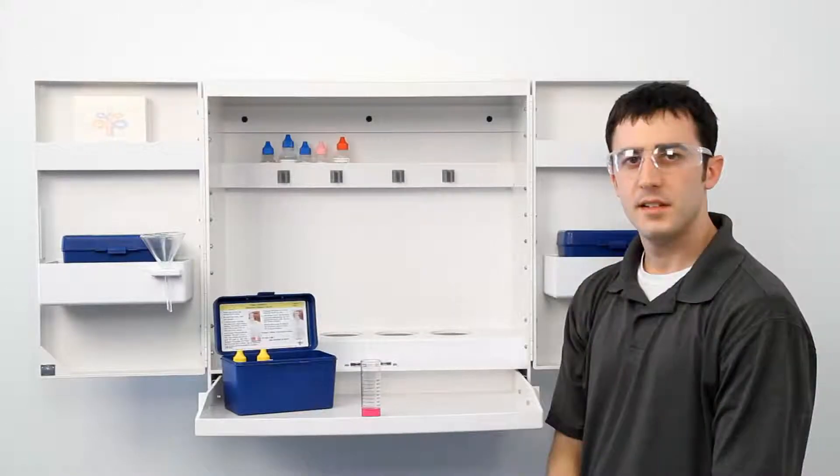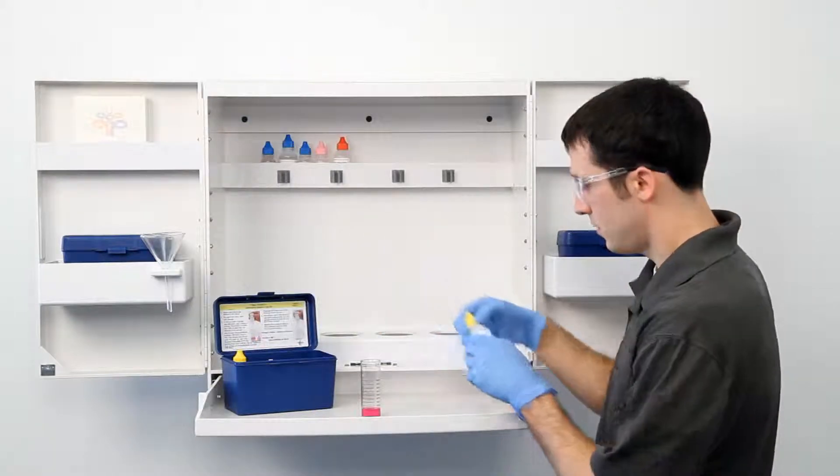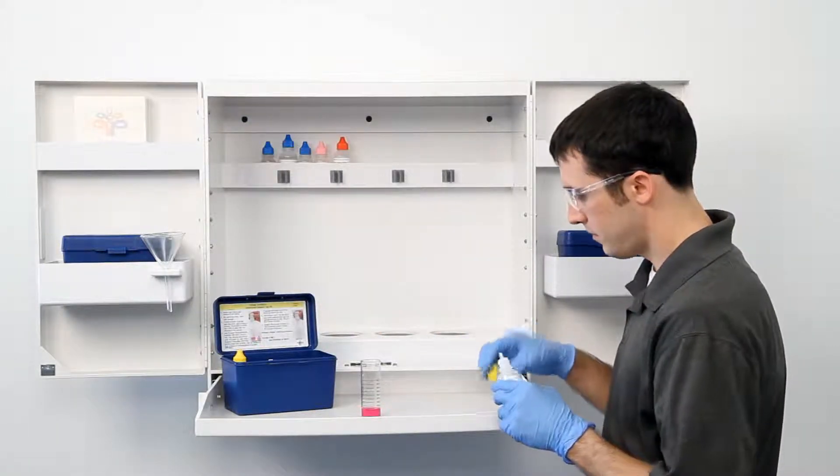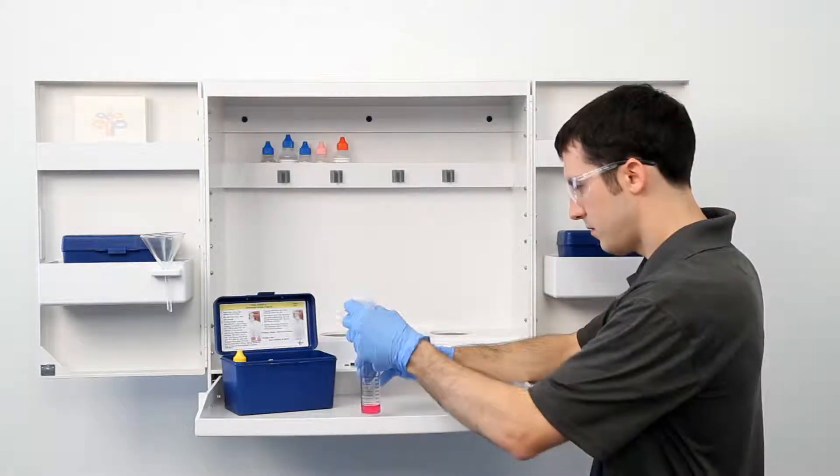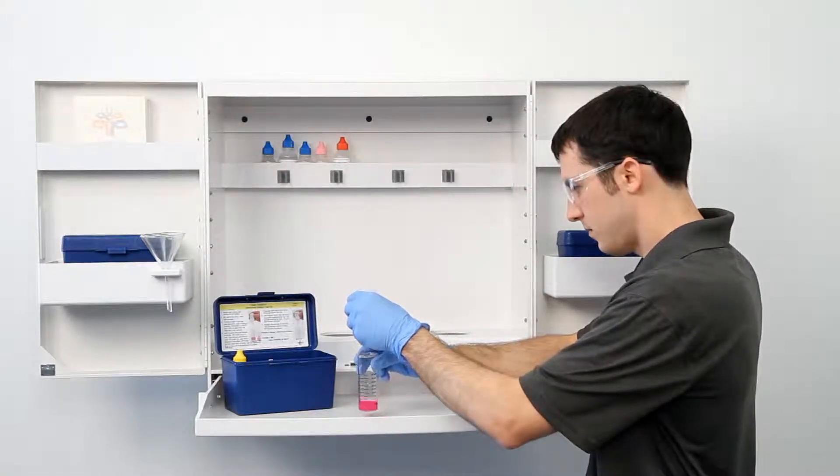The next step according to the Endpoint ID procedure is to perform the titration. You have several choices of titrant strength. Reference the Endpoint ID Plus instruction sheet or the test factor card to determine the proper titrant normalcy. It's important to make sure you have the proper titrant and the proper sample size for this titration.